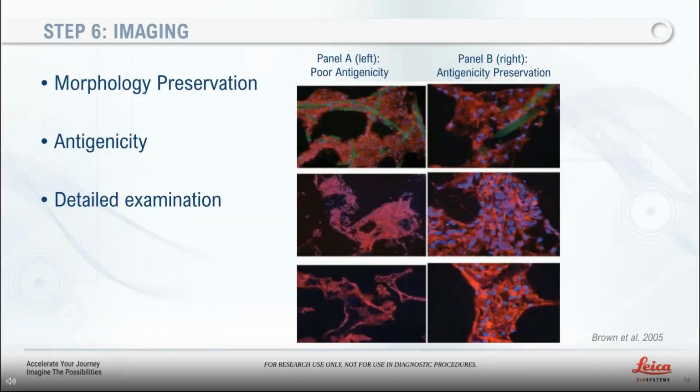Most, if not all, researchers who want to understand where a protein of interest is localized in a cell or tissue usually choose a fluorescent microscopy technique. Compound fluorescent or confocal microscopes are good examples.